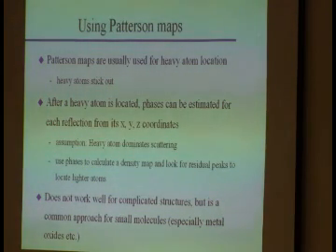Now, when do Patterson maps work well? Well, they work well if you have a fairly simple structure and one heavy atom. Okay? And that's kind of a flexible expression. What is fairly simple? What is heavy, right? Well, depends a lot on what your material is, okay? Small molecules, this often works very well, especially if you, for example, have a metal oxide. Because most metals are a lot heavier than oxygen, okay?